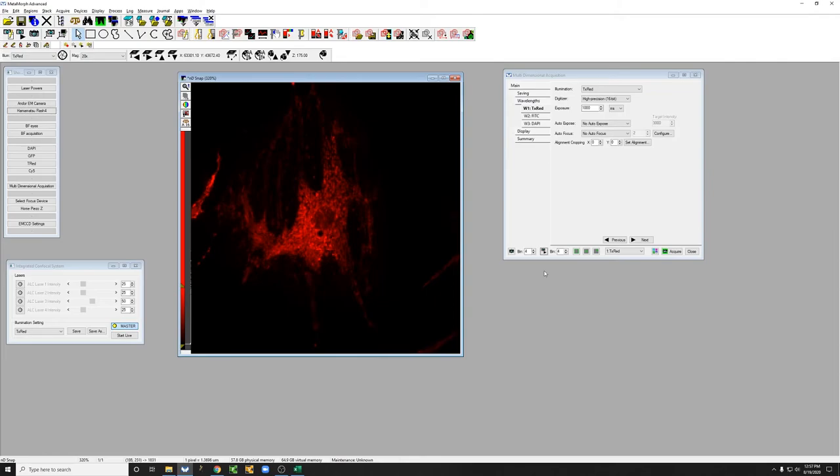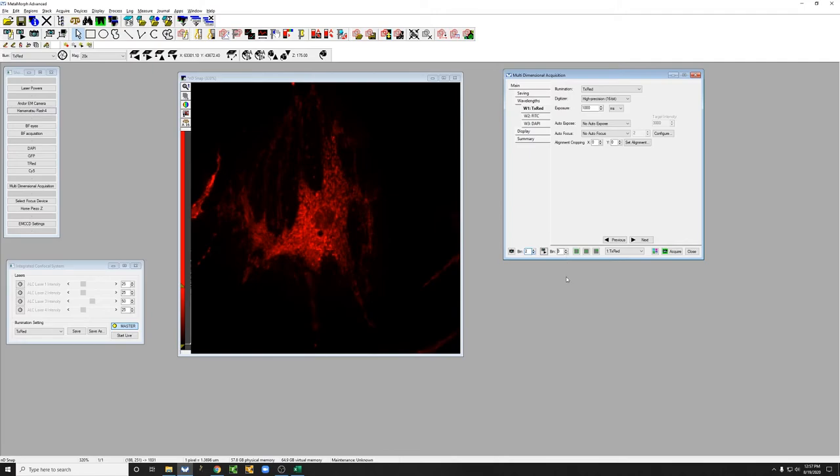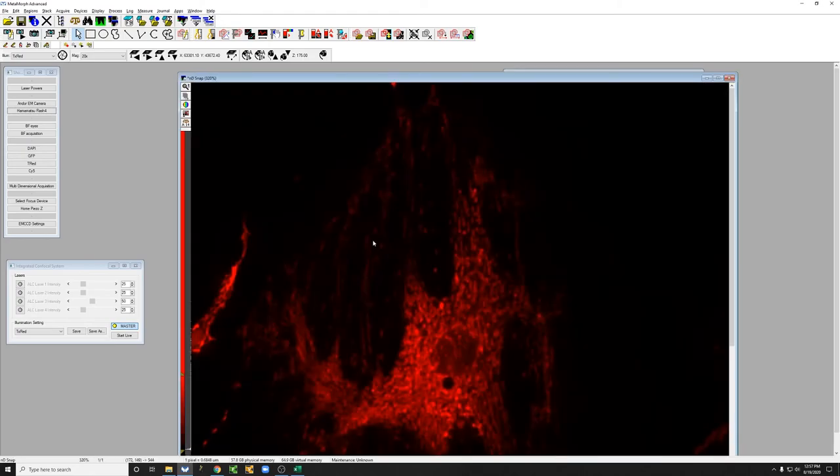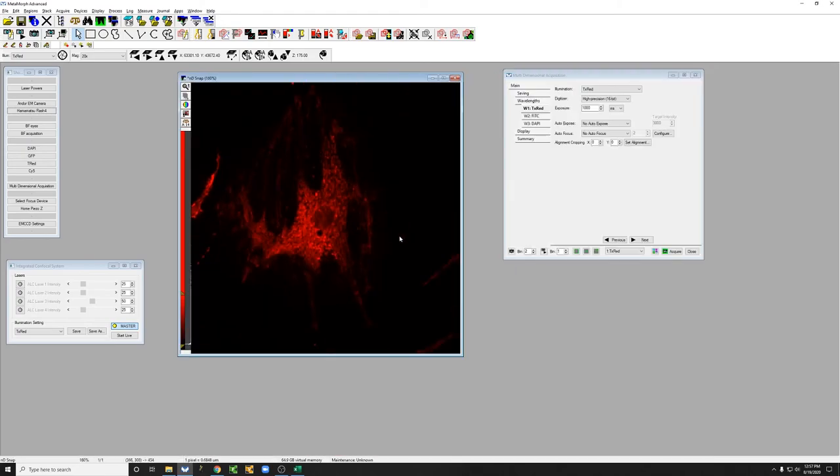So let's go back to a binning of one where we have higher resolution, set up the other two channels and actually acquire a data set. So I'm happy with how the Texas red looks. There we go.